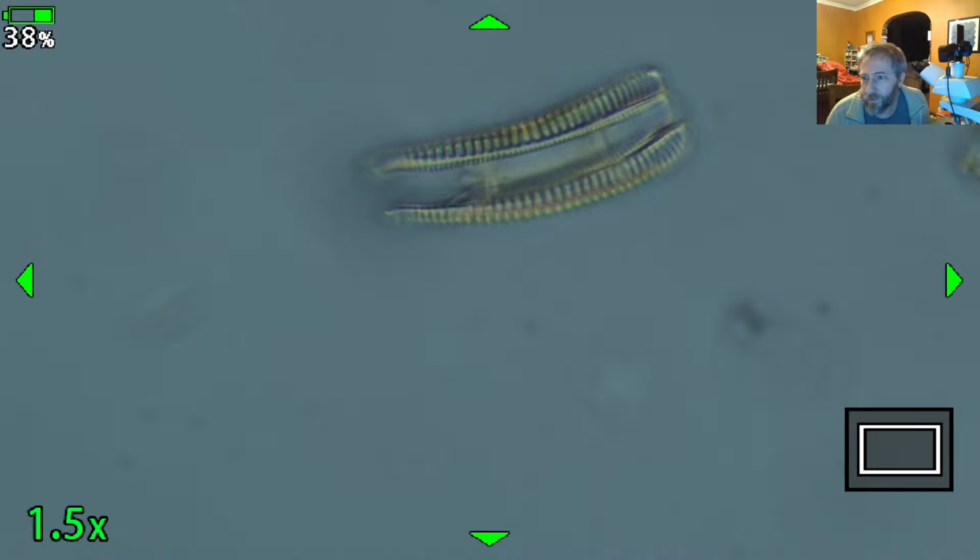So there's a huge advantage to it in that they create a cell wall that's rigid, but then there are things they have to do in order to have that cell wall. So the reproductive cycle is actually kind of limited by the fact that they can't grow. They can only shrink when they reproduce.